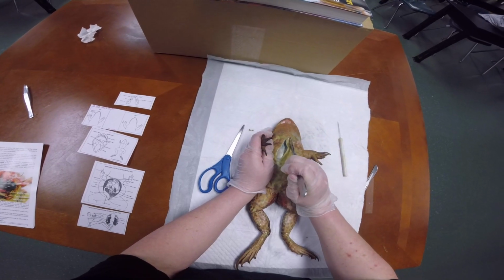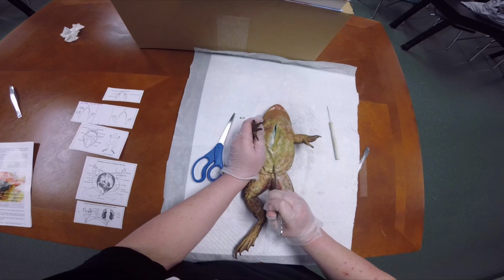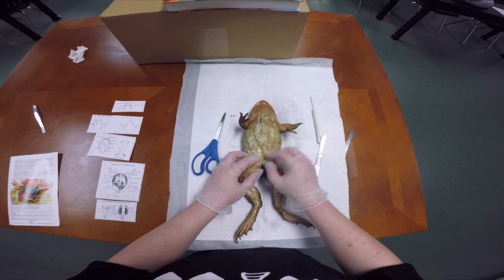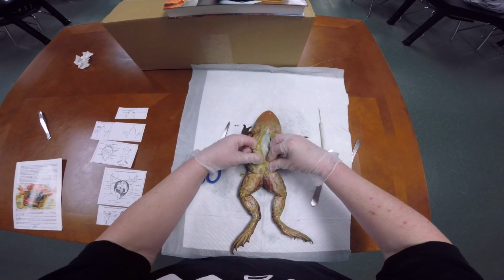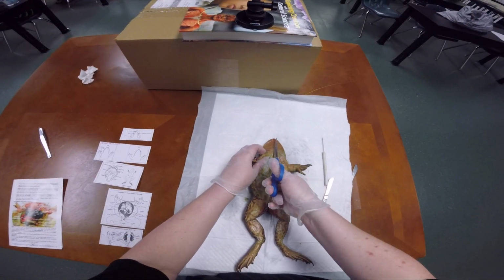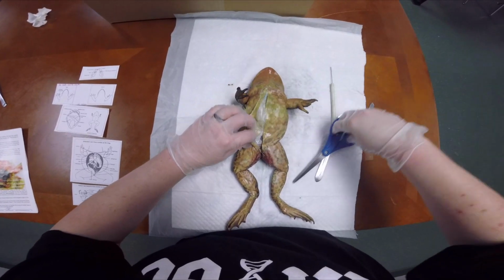I'm going to go all the way down, try to stay as straight as I can, down to the cloaca. So the cloaca is going to be down here, the lips up here, and I think I'm going to have to bring in this guy. So then we get our scissors, got that, and we'll cut down.